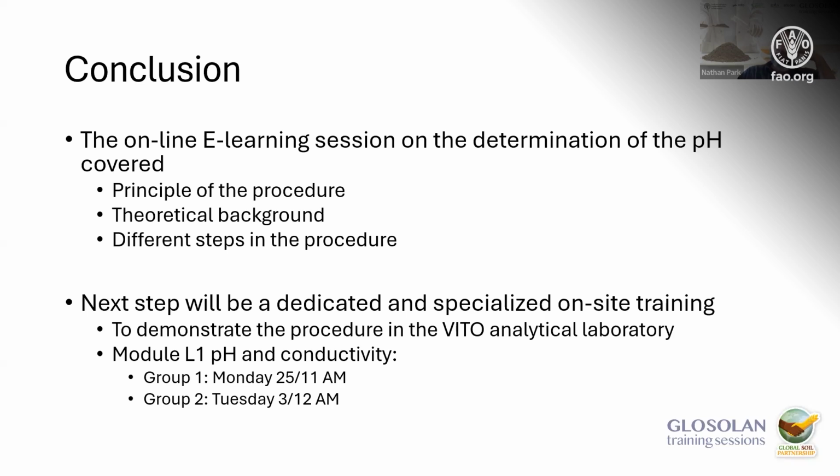If there is a reason, maybe an extreme pH value, you might see it in your original sample, although you sieve it. But given that your intake is about 10 milliliters or so, you still have a representative amount of the soil sample, so that should normally have less impact.